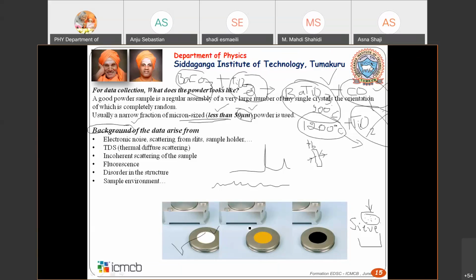So next, when it comes to your peak width, as we already discussed in the previous session, this peak width can be due to your sample and also due to your instrument. Those are things you need to take care of. Anyhow, we will not discuss them again because we already did. The peak width can be due to your instrumentation or even just due to the sample.